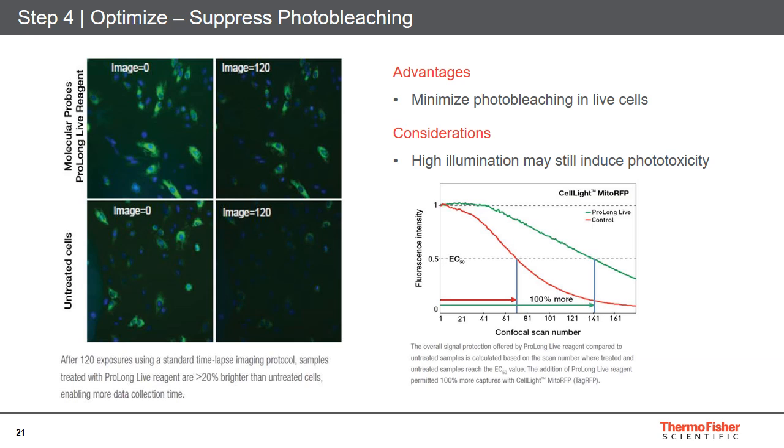Another consideration to think about with this approach, though, is just because you're able to protect the signal from photobleaching, that doesn't mean that you should continue to put light into the system, because even though you have signal remaining from your fluorophores, high illumination may still induce phototoxicity.